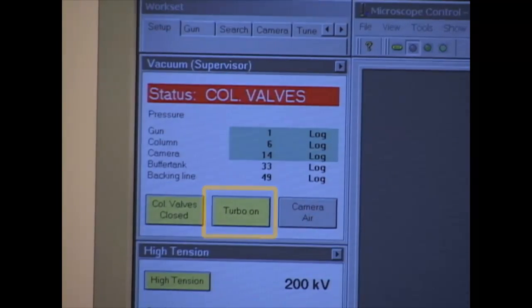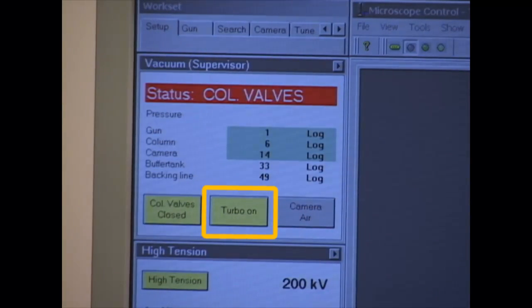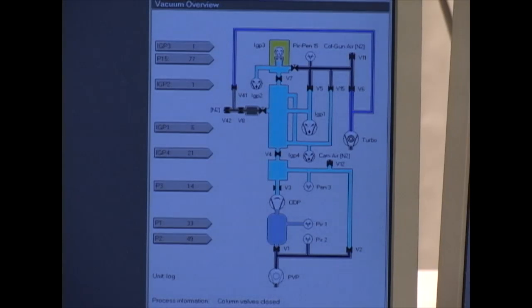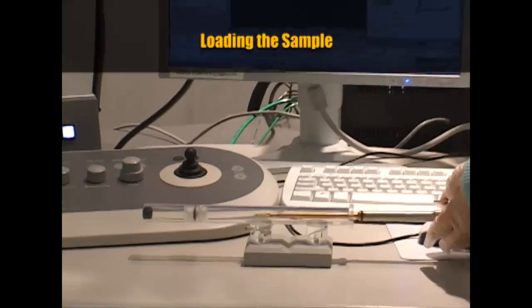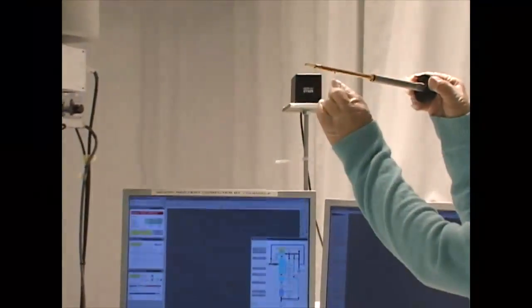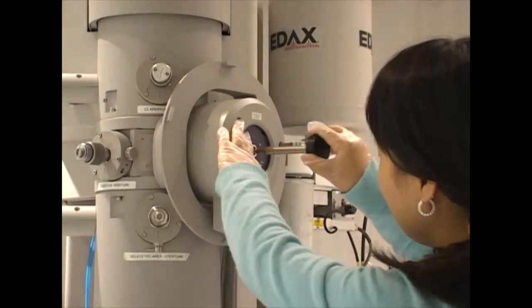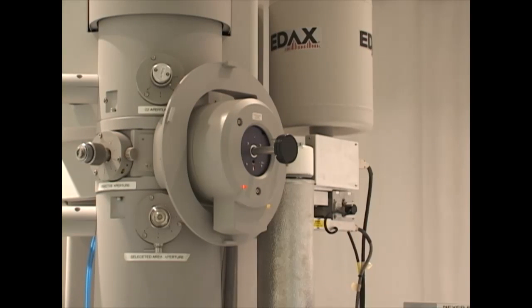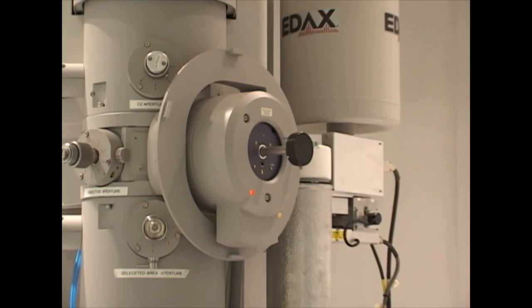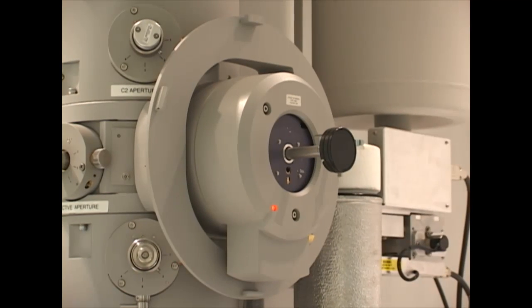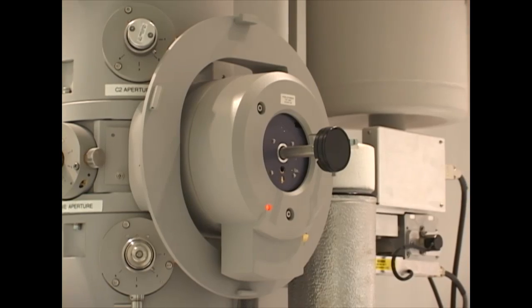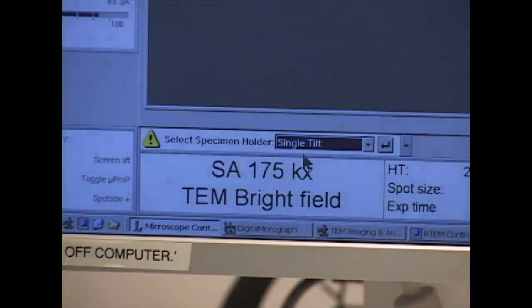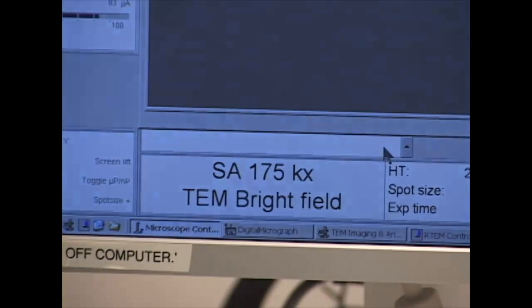Now, the Turbo On button is yellow, indicating the turbo pump has reached its full function and the TEM is ready to receive the sample. Take the holder out of the support. Place the little pin on the holder in the 5 o'clock position with a twist adjustment. The light goes on, the valves are opened, and the pump evacuates the sample chamber. You must wait for several minutes until the light goes off, or you could crash the vacuum. You must also tell the computer that it is a single-tilt holder, so that the holder can be controlled with a joystick.